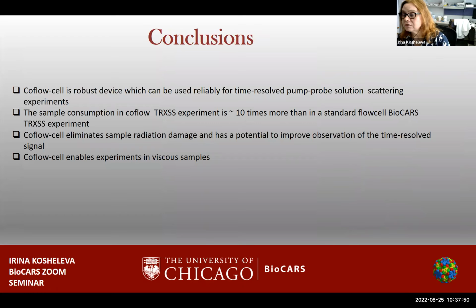With that, it will be my conclusion. The co-flow cell showed itself as a robust device, which can be used reliably for time-resolved pump probe solution scattering experiments, especially for radiation-sensitive, viscous, irreversible reactions, which are difficult to do in the standard flow cell.